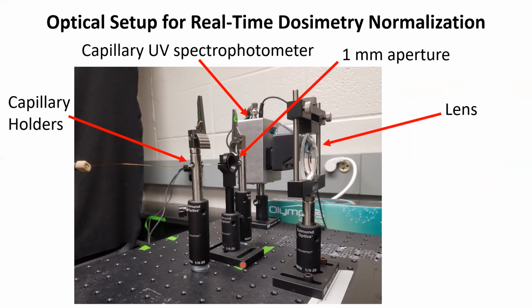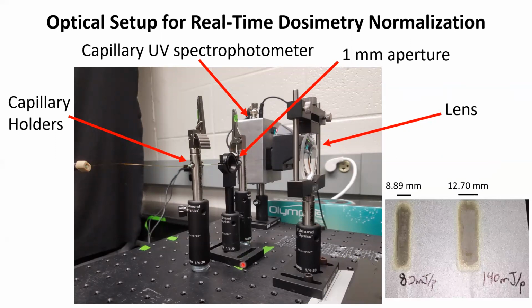For KrF excimer lasers, the way you increase the energy is you turn up the voltage on the thyratron. This increases the energy per pulse being emitted from the laser. When you do that, however, in an excimer laser, you don't just increase the fluence, or the photon density per unit area of the beam cross-section. You also increase the beam size.